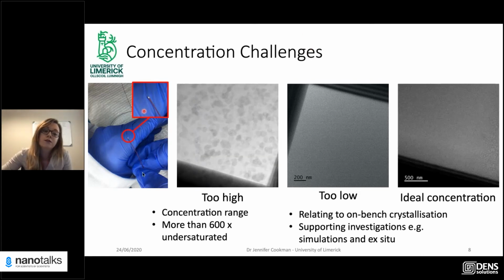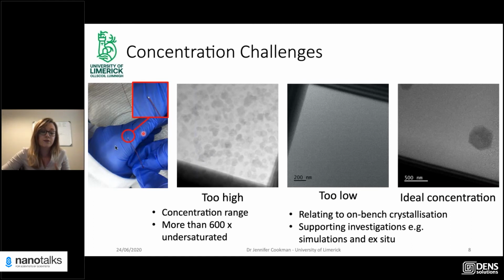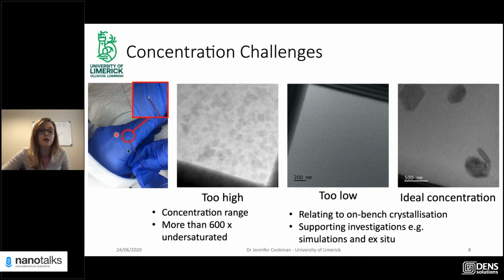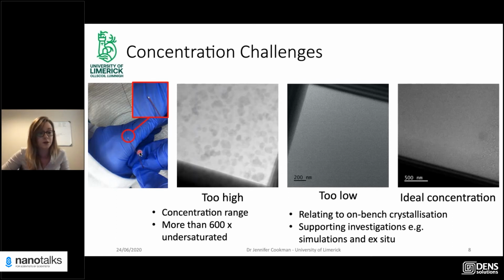So what I'm showing you on the left-hand side is a very high concentration, and I think it was about 150 millimoles. On the end of the tubing, because the ethanol can evaporate quite easily, the evaporation led to crystallization of flufenamic acid on the edges of the PEEK tubing. So this PEEK tubing is part of the whole liquid cell equipment. You know then that this can obviously block the tubing and suspend your experiments, or even if this ends up crystallizing between your windows, you just have too high of a concentration, the crystal is too thick, and you won't be able to actually see anything in between your windows.